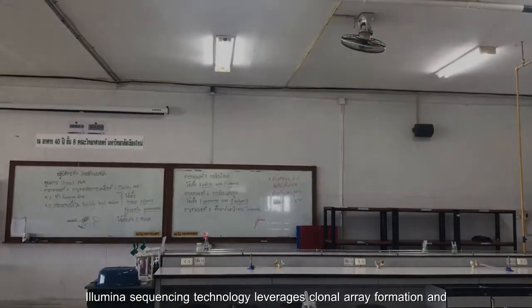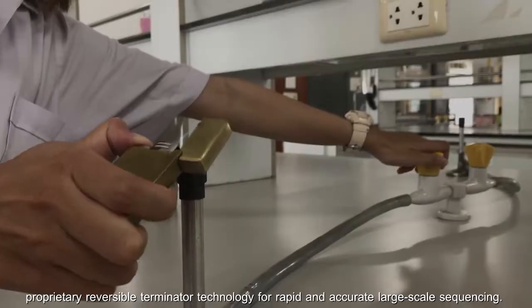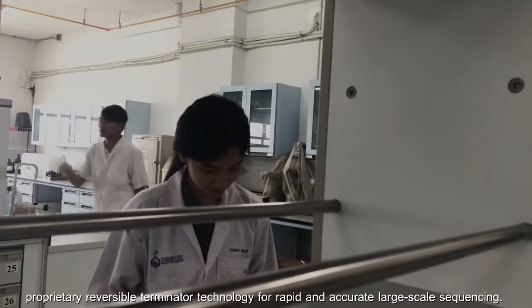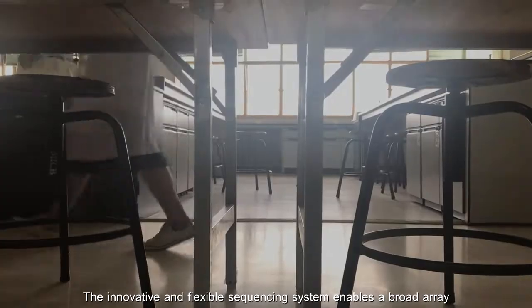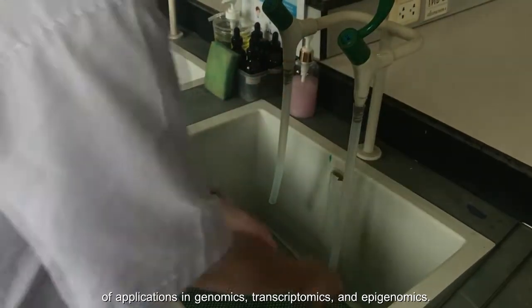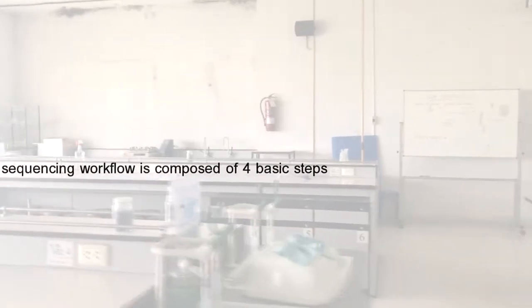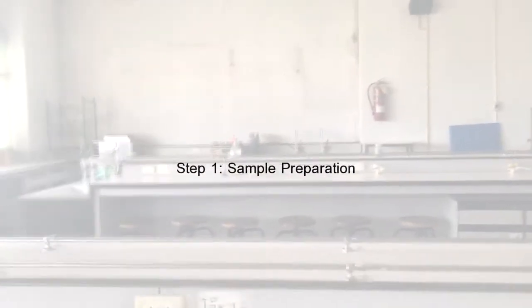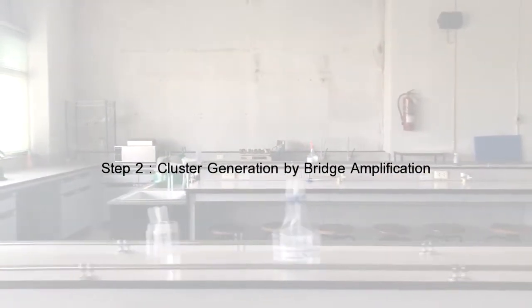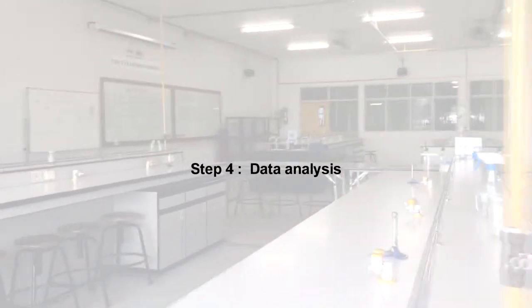Illumina sequencing technology leverages clonal array formation and proprietary reversible terminator technology for rapid and accurate large-scale sequencing. The innovative and flexible sequencing system enables a broad array of applications in genomic, transcriptomic, and epigenomic research. The Illumina sequencing workflow is composed of four basic steps. Step 1, sample preparation. Step 2, cluster generation by bridge amplification. Step 3, sequencing by synthesis. Step 4, data analysis.